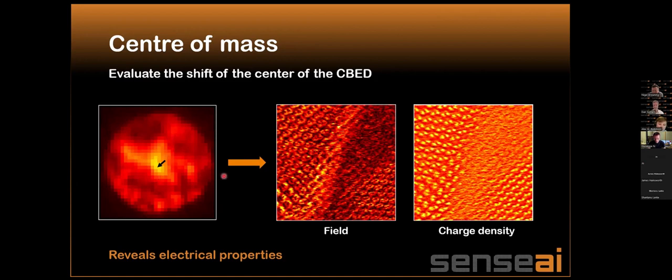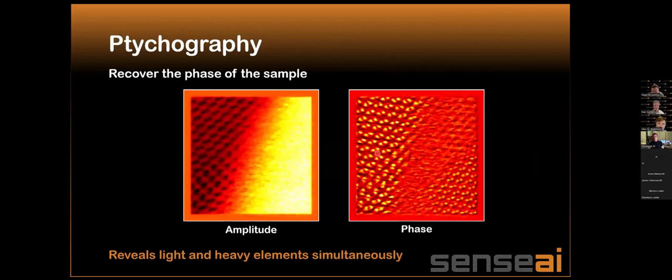And then we can measure that and then form the projected electric field, as we can see here, or we can perform the divergence of that field to get out our charge density. This is really nice high resolution imaging, which is quite low complexity in terms of computation, but very rich in information. And that comes from being able to have access to all of the scattering information.